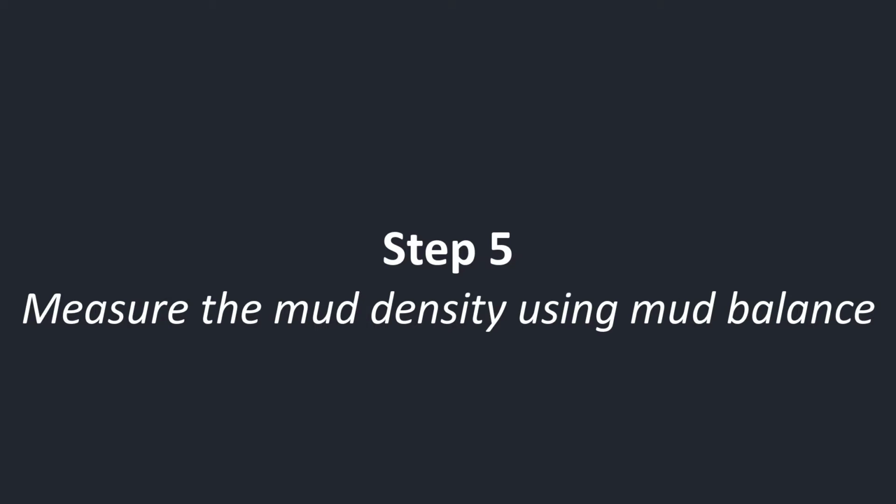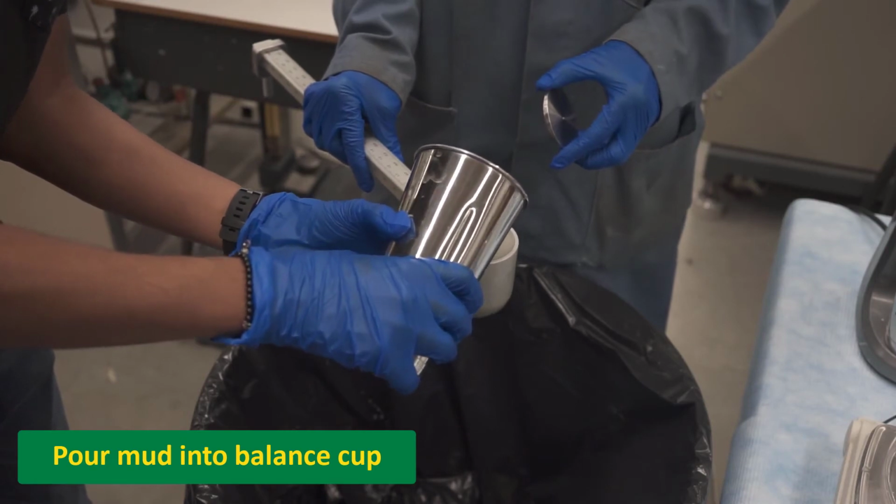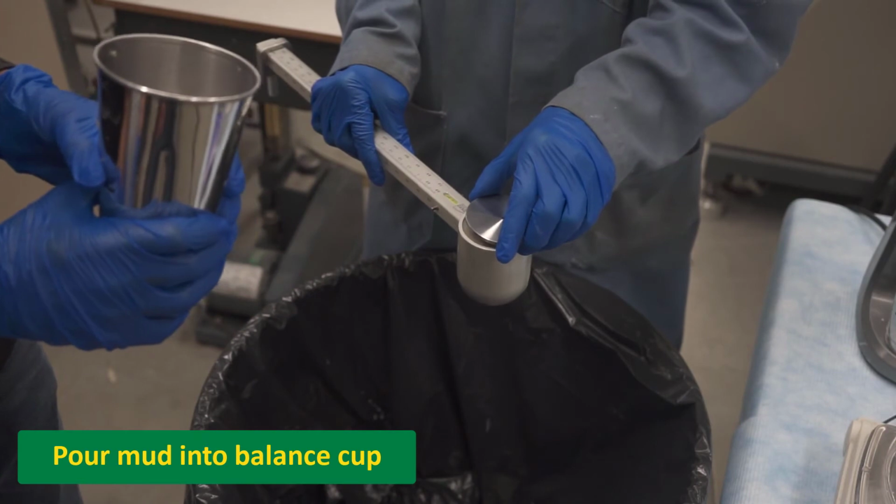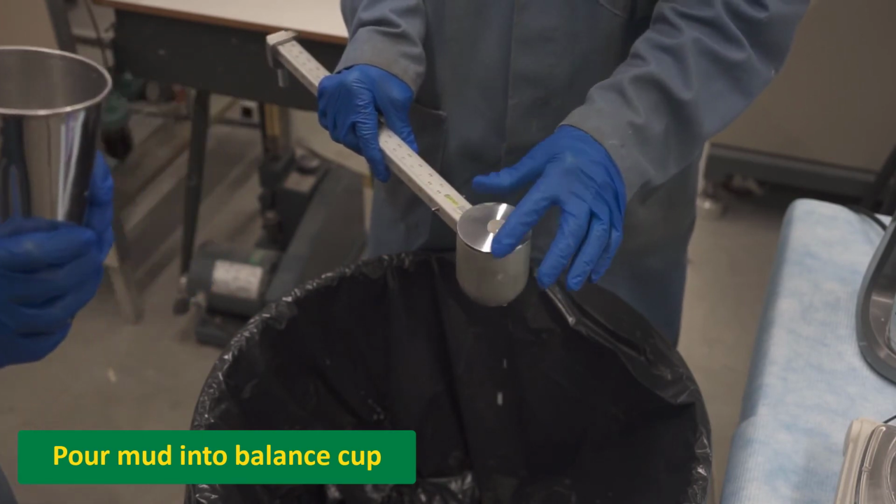Now, measure the mud density using a mud balance. The ppg should be measured to 2 decimals, and the SG should be measured to 3 decimals.